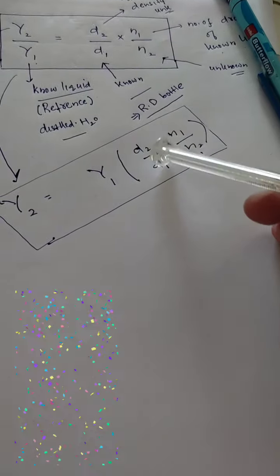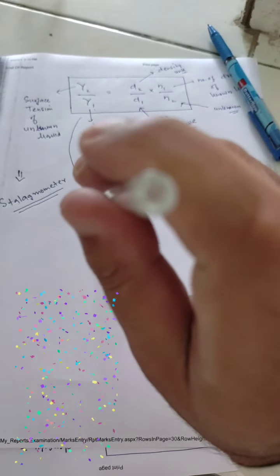Then इसका जो टॉप है यहाँ पे, you can see this here. आप इसको सक भी कर सकते हो लिक्विड को. यहाँ से नीचे आपने लिक्विड रखा हुआ N1 solvent reference, या you can use a rubber tubing also. ठीक है. With the help of that rubber tubing you can suck the liquid. So once you suck a given volume of liquid, ठीक, so you suck it up to this mark. ठीक है. Let us say this mark above this bulb, remember this.